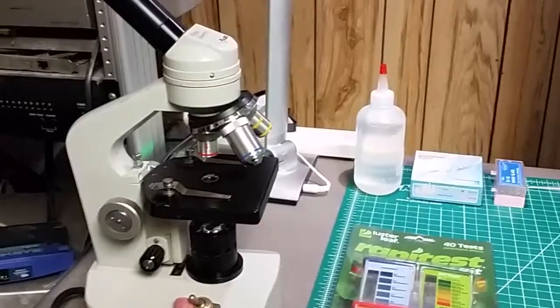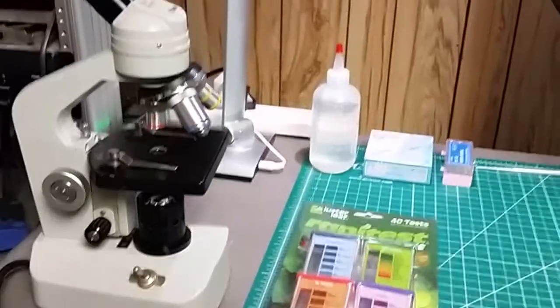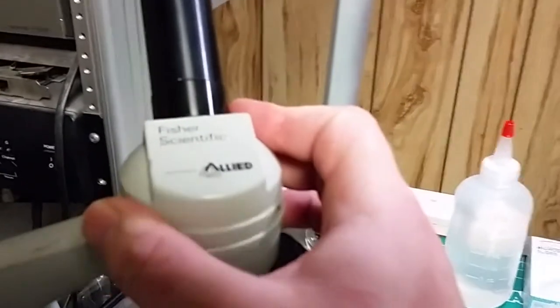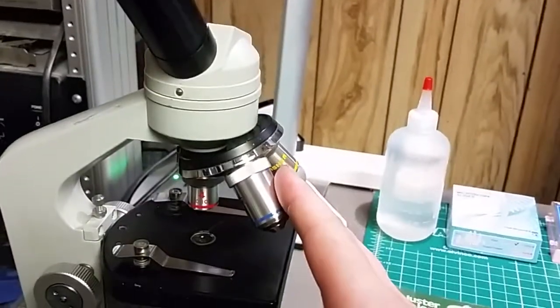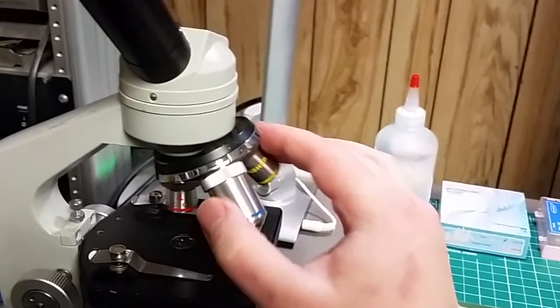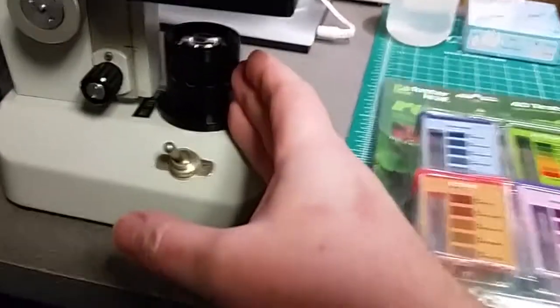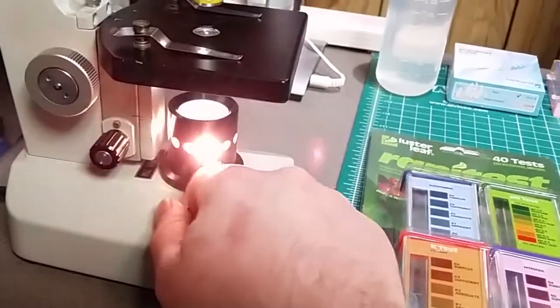And this is for the test that does matter. Just a little bit of history about this scope — it was a yard sale find for a whopping $15. This is an old Fisher Scientific microscope; they don't sell this model anymore but it's pretty similar to the ones they currently sell. We've got a 10x eyepiece, and a 4x, 10x, and 40x objective. We have a dialable orifice on the illuminator, and I believe it's a xenon illuminator.